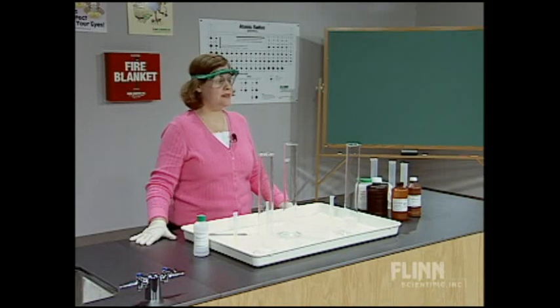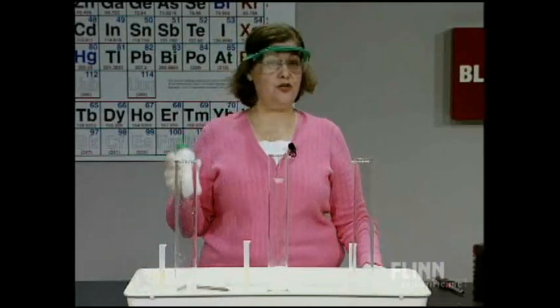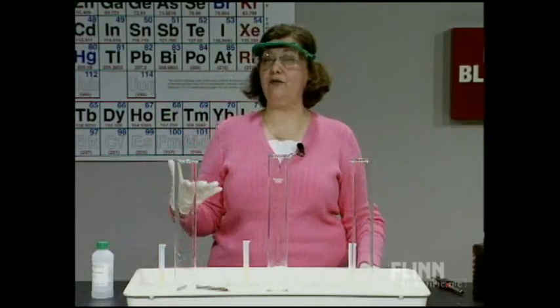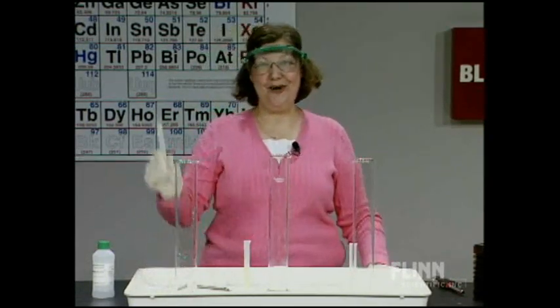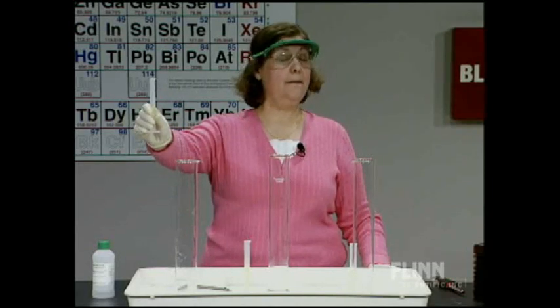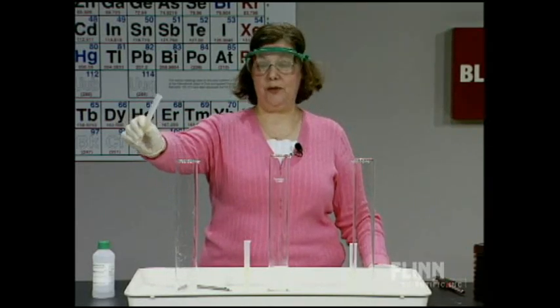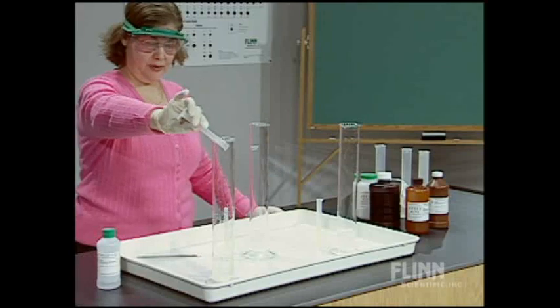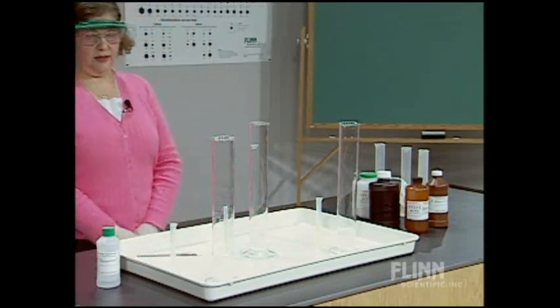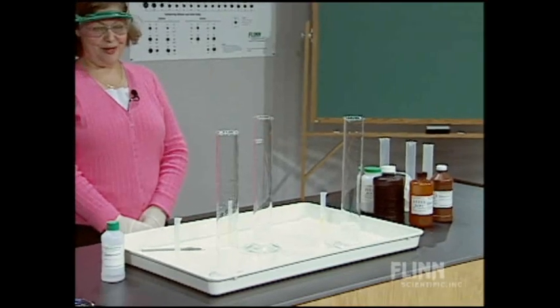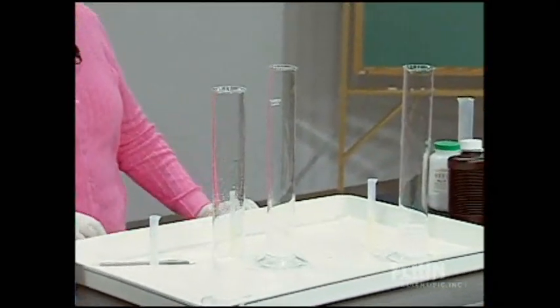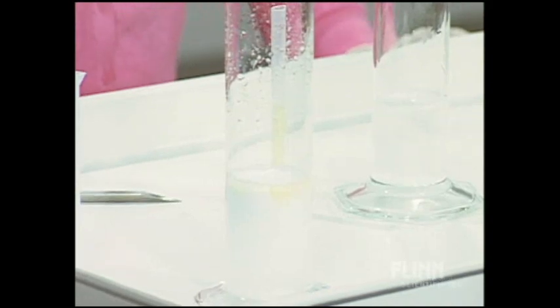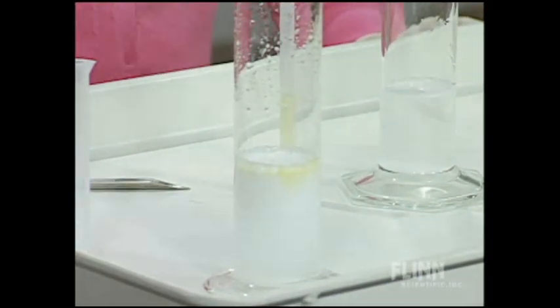We want to focus on the effect of concentration on the rate of the reaction. I'm going to start with the first one on the right, which has 3% hydrogen peroxide — that's normal drugstore hydrogen peroxide. I'll go ahead and add the catalyst. The catalyst is added; we start seeing a little bit of bubbles, just a tinge of yellow in there. It's a pretty slow reaction — we can see bubbles being formed, but it's pretty slow.